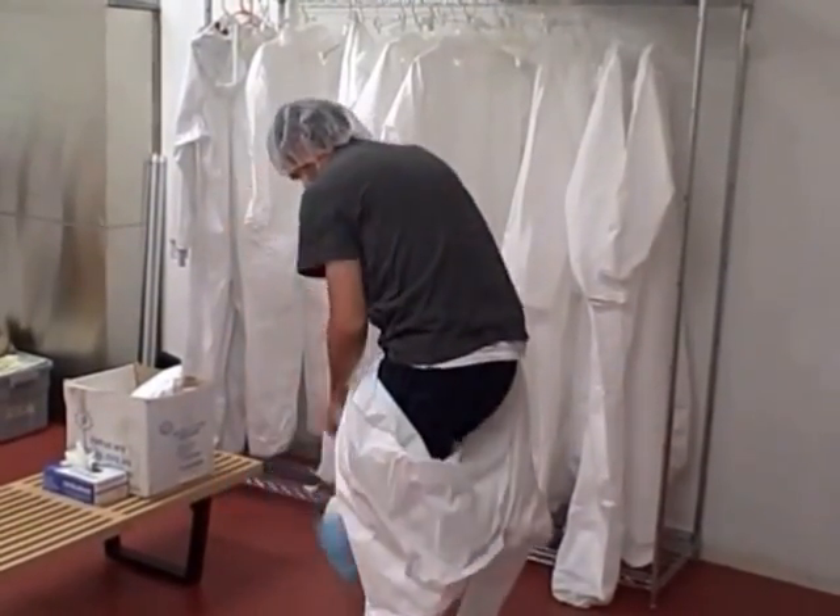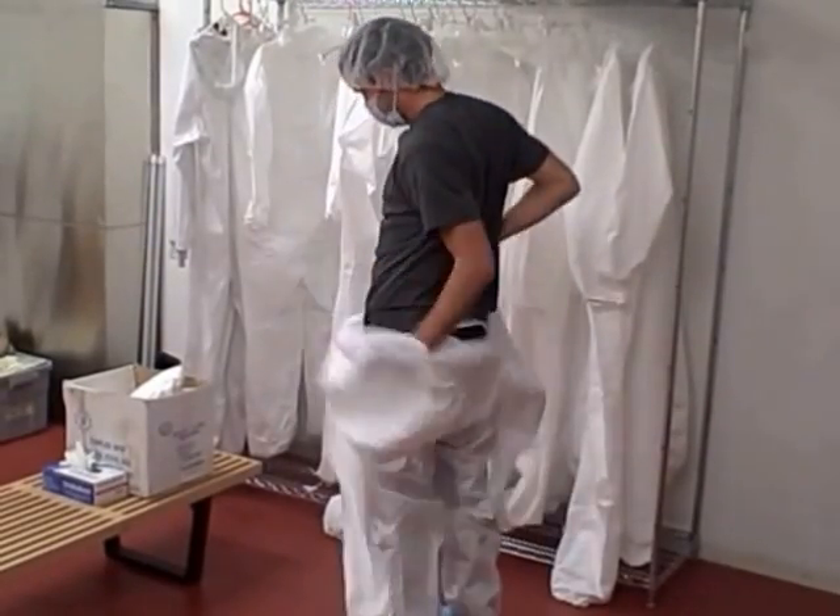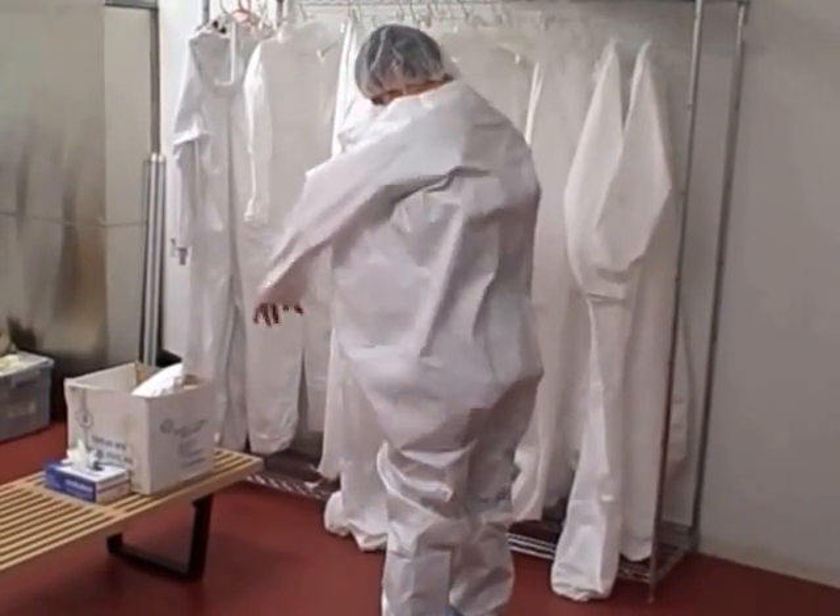Zip up your suit and make sure the leggings of the suit are tucked into the shoe covers. Then take a seat on the bench facing the entrance.